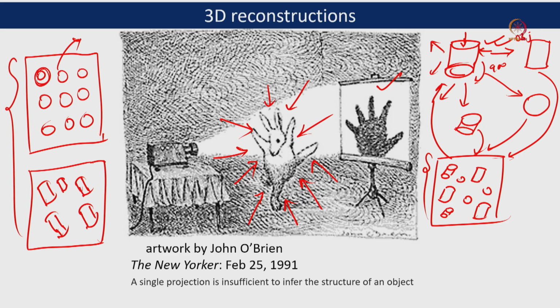So here, when we are talking about single particle analysis, we are targeting individual molecules or individual protein molecules. When we are thinking about tomography, what we are doing is, if this is our sample, we are tilting the stage.